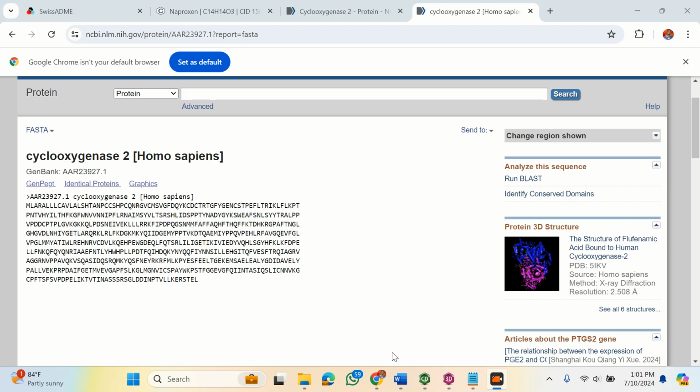Let's see if our search was correct. At the end, it was able to get over 35 templates out of the 500 that it actually extracted information from. Okay, and then at the end, it has sorted them, and we pick about this first one.